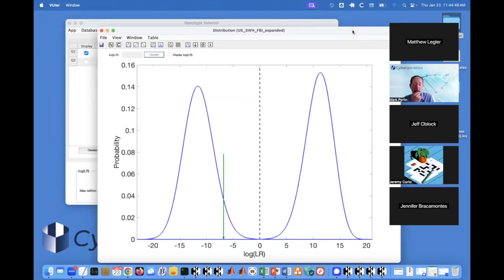Please do. Okay, so what's really nice is that when you're looking at both the non-contributor on the left, that bell curve, and the contributor on the right, and that bell curve, and they're both bell curves, what is the overlap of misclassification? So take a look at 0 and ask yourself, to what extent is there any confusion?